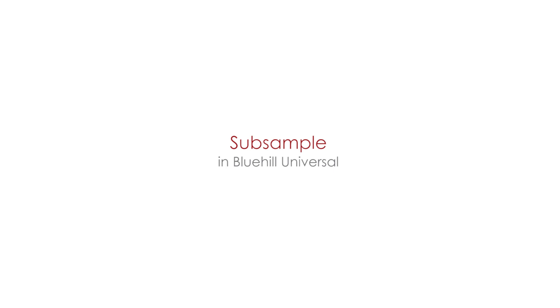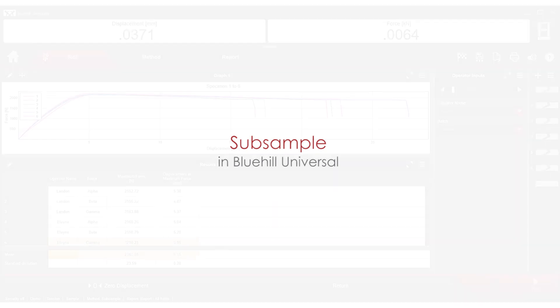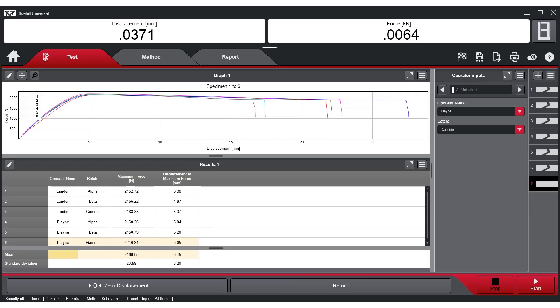Using SubSample in BlueHill Universal, users have the ability to sort results by all parameters, including operator name, specimen break location, and specific specimen properties.